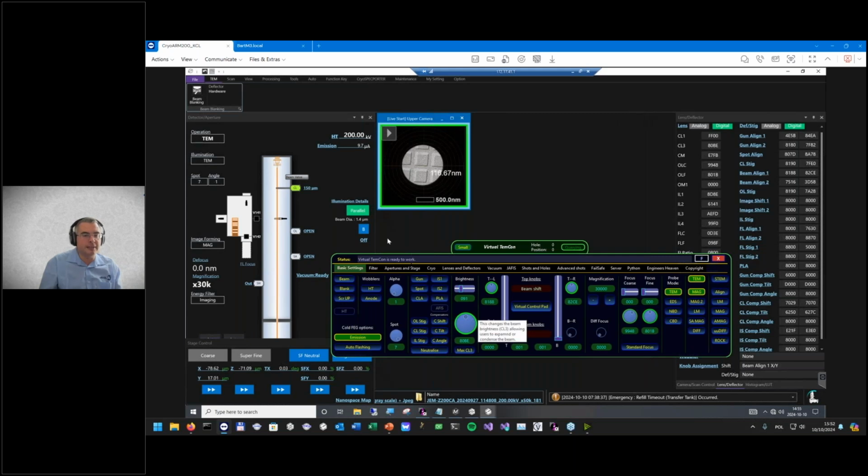So this is much easier than going into the illumination menu and then selecting step and clicking on arrows. Here, the step can be configured more smoothly, and it's normally easier to use the mouse wheel rather than click, click, click, click, click, click. Same goes for moving the beam, for moving around.